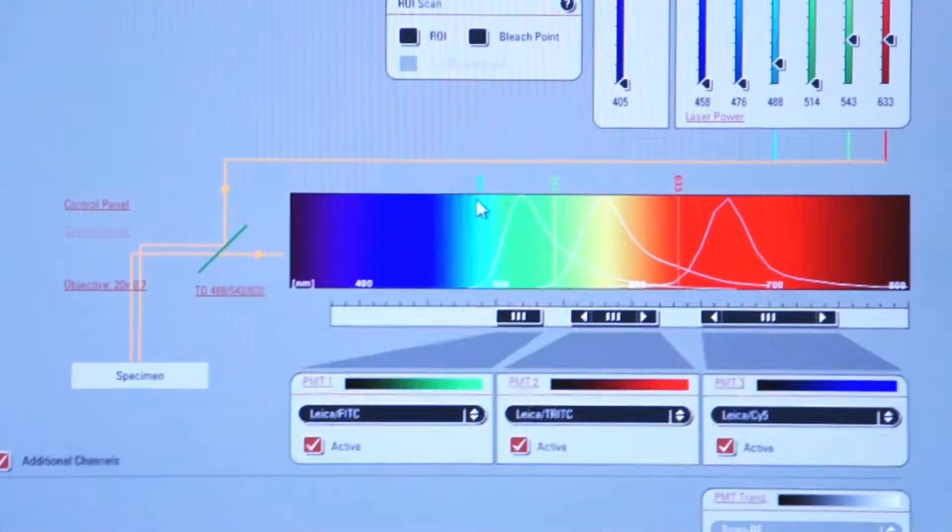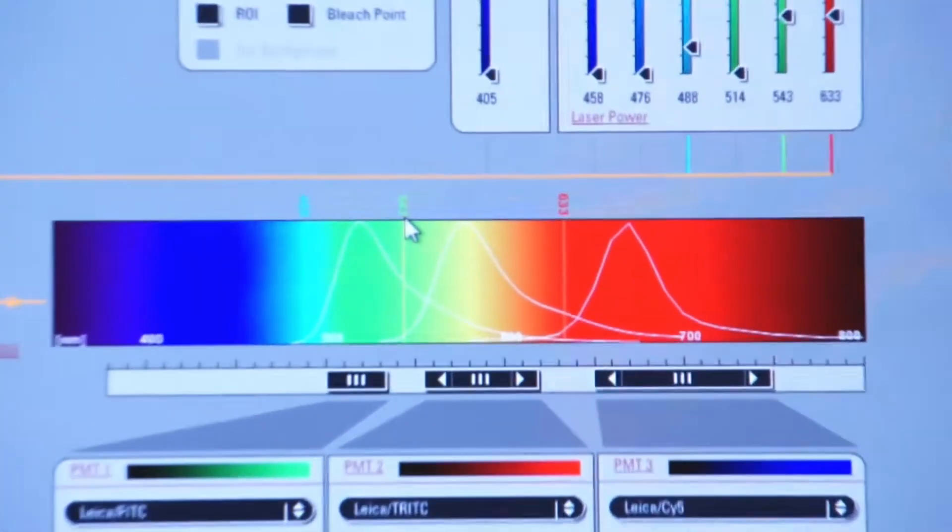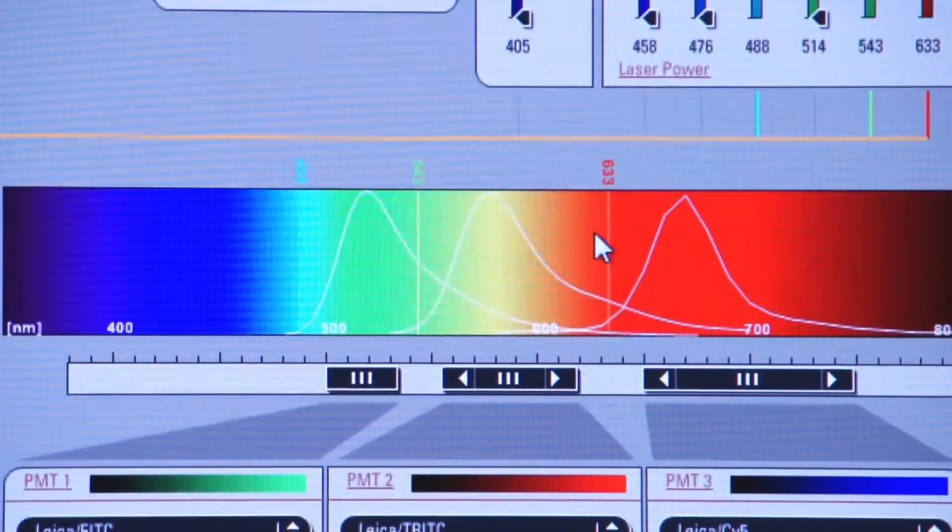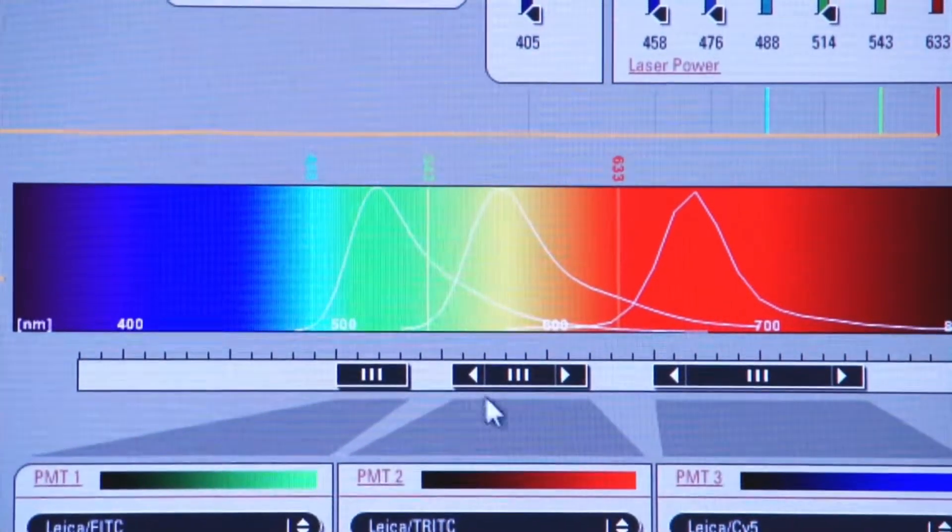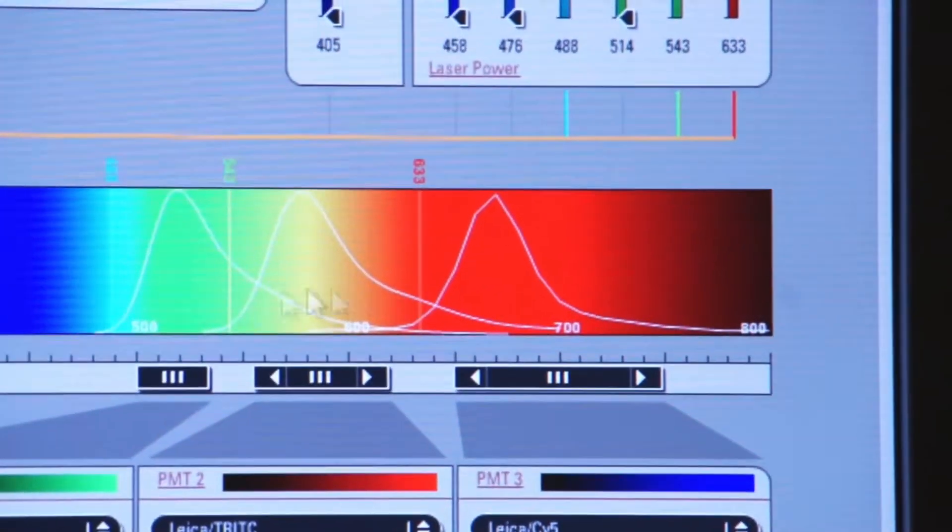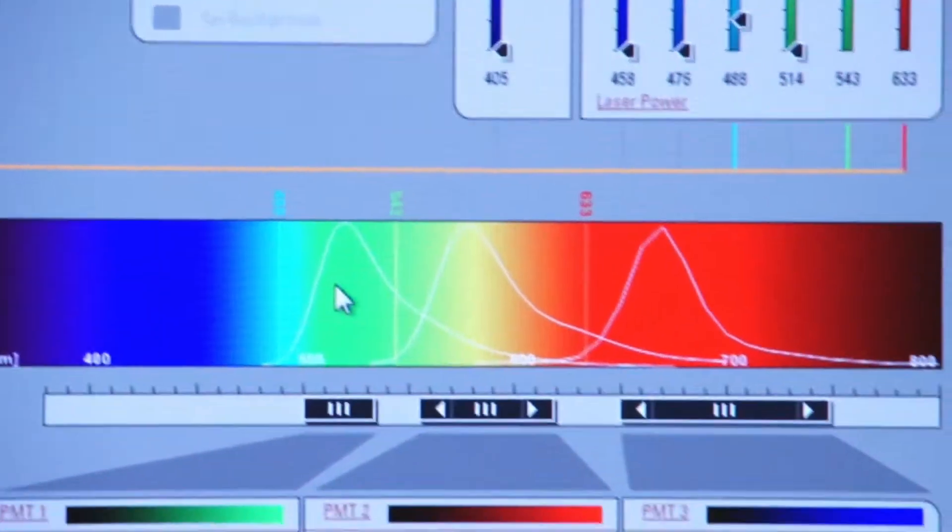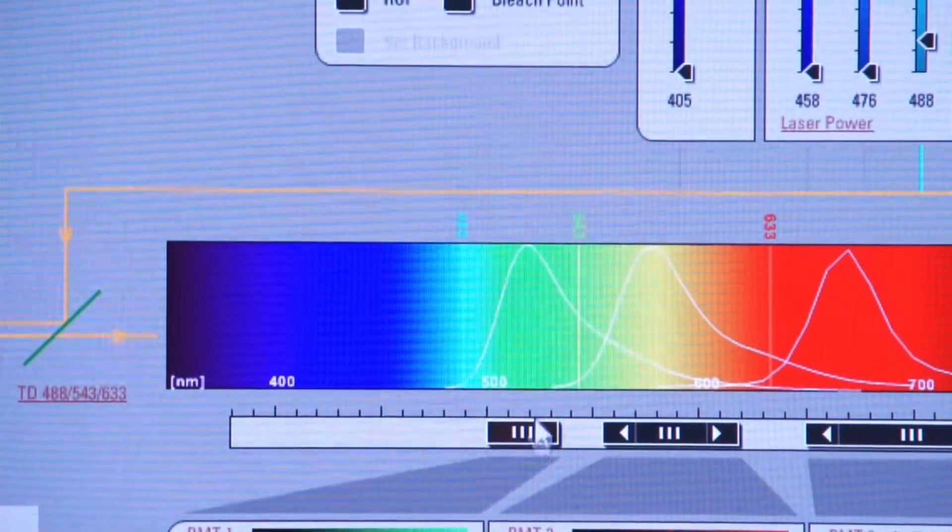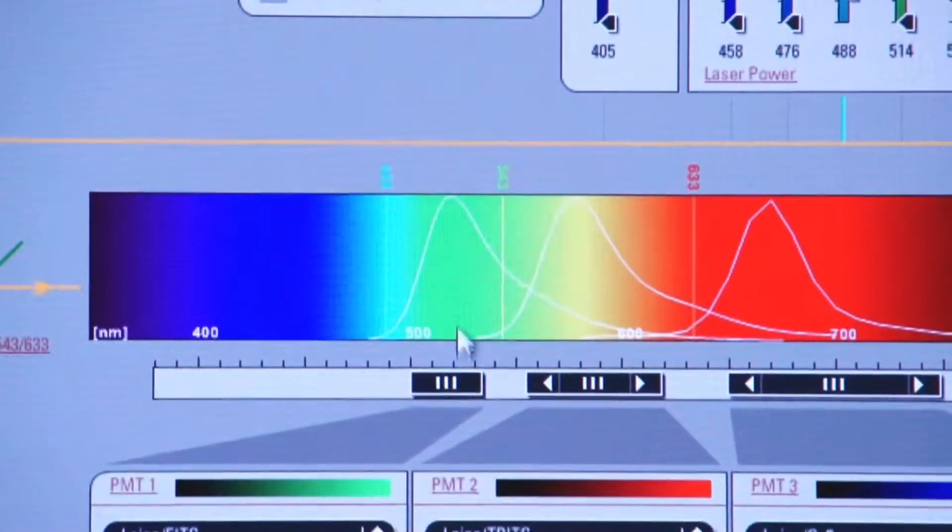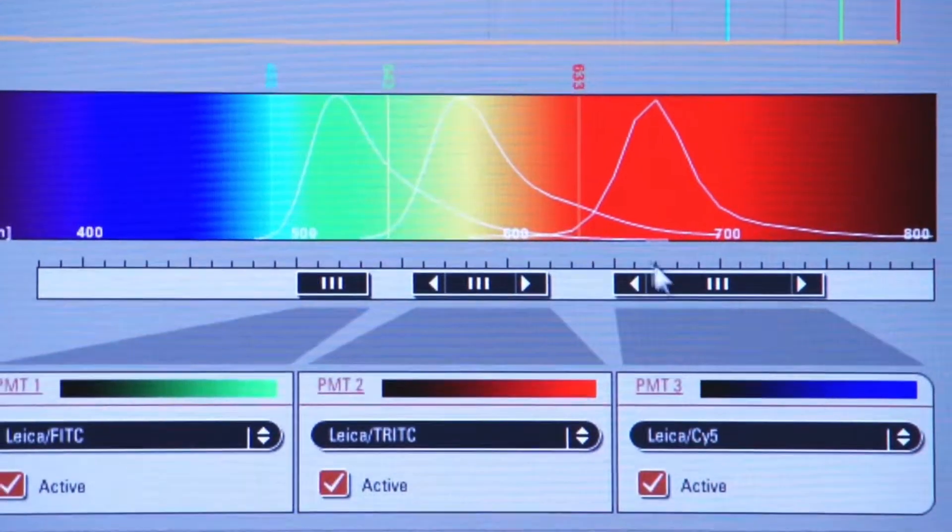But you see a 488 laser line, a 543 laser line, and a 633 laser line all illuminated on our spectrum. You also see the various emission curves as a result of the excitation based on these laser lines. And concurrently, we have photomultiplier tubes set below this graph where the emission is going to take place. This PMT is collecting here, this PMT is collecting here, and this PMT is collecting here.